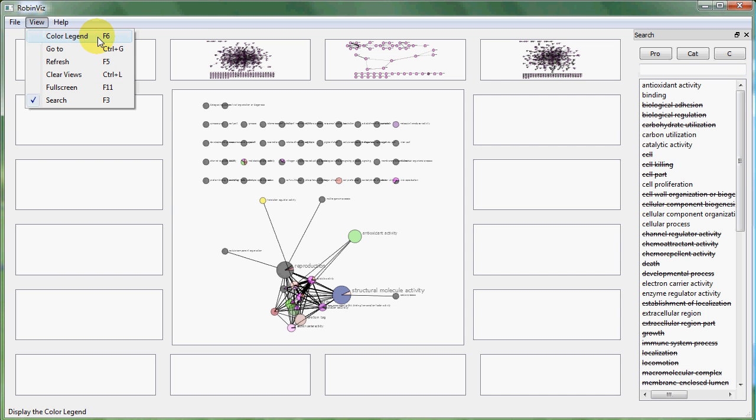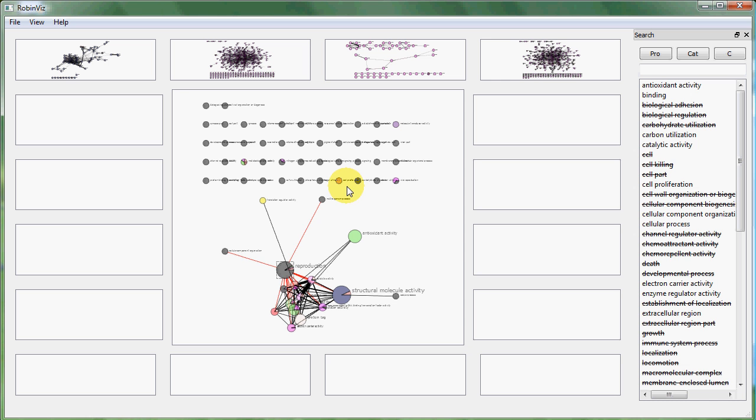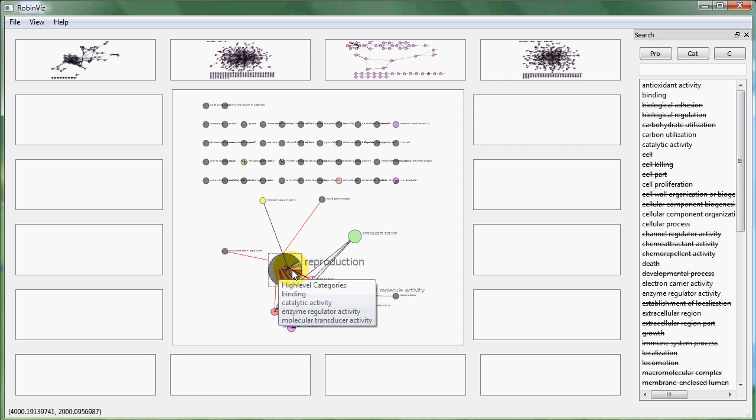and we can go to the defined clusters or categories by numbering. For example, it says go to by cluster or category 0, and it just selects the number 0 category or cluster. This is more useful in the by clustering part in the co-expression mode.